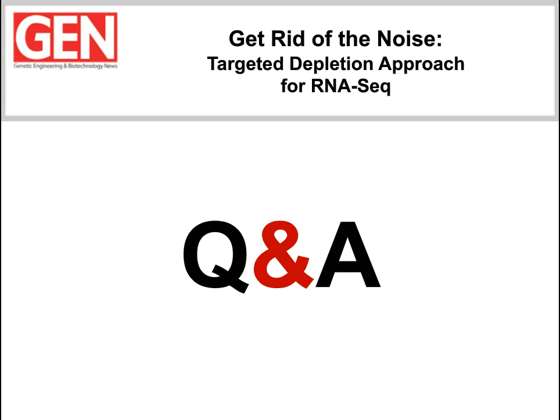Sure, that's a great question. The InDA-C technology is actually used for depletion of unwanted or uninformative transcripts. So while the removal of these transcripts does enrich and allow for better coverage of informative transcripts, it's not actually enriching for specific transcripts. For targeted enrichment, I would actually recommend using our targeted enrichment products, which are also completely customizable and allow you to specifically enrich for the transcripts that you may want to study.